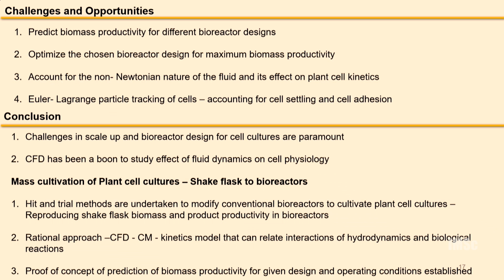So we can do the same process for different bioreactor designs in silico and see which has the maximum biomass productivity. We can also look into different bioreactor configurations and see whether some other configuration is going to help the system grow better.